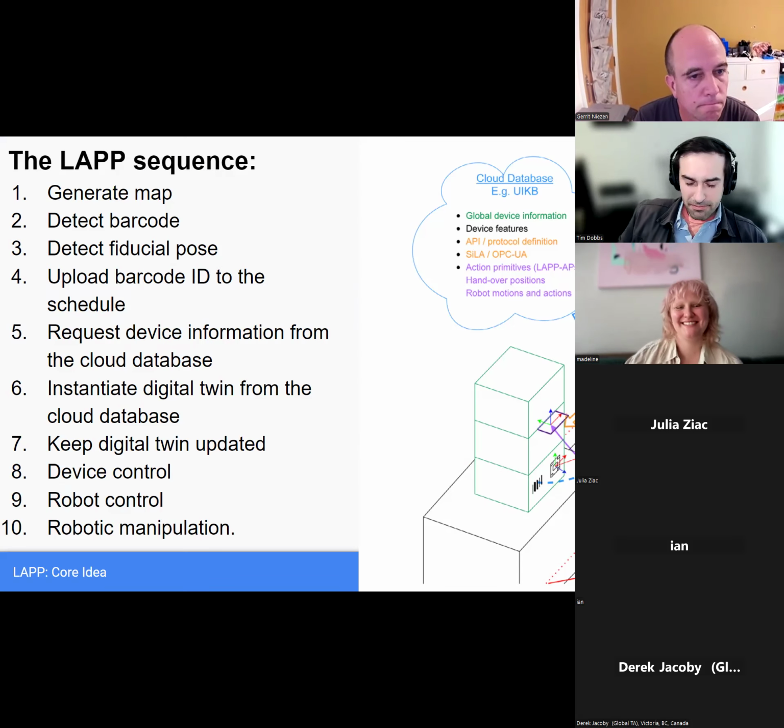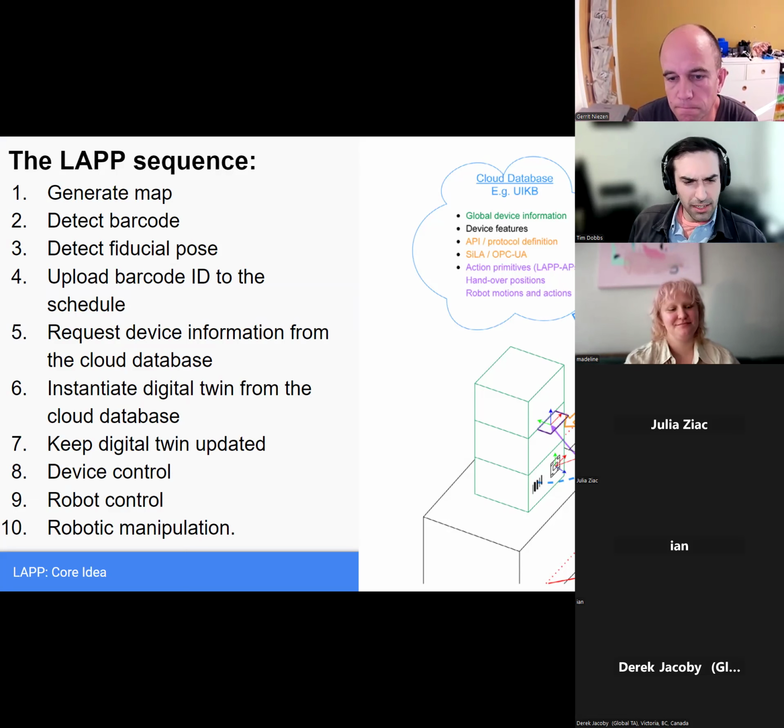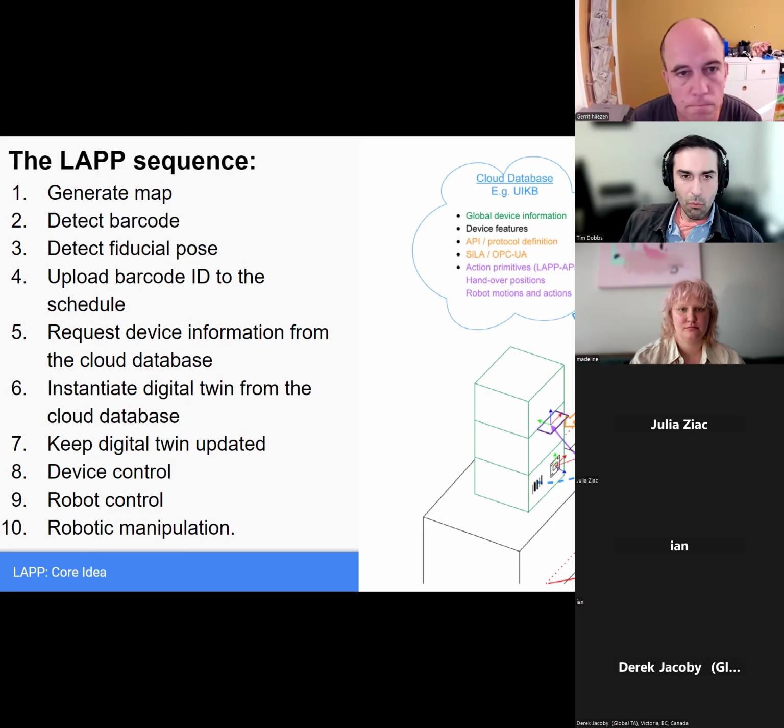Oh well. The thing that really stuck out to me here was the realization that you need to keep track of what to do in a device-level way, of this device, hey, I can open trays or I can take readings. But you also need to talk about where to do it in all this automation, which is not a way I'd quite framed it before.